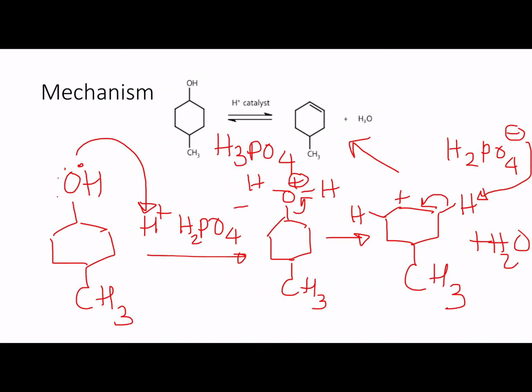Okay. And then what we're going to do, after we collect, is a workup, meaning to isolate our product, and then we dry the product with magnesium sulfate and we will do a gas chromatograph.